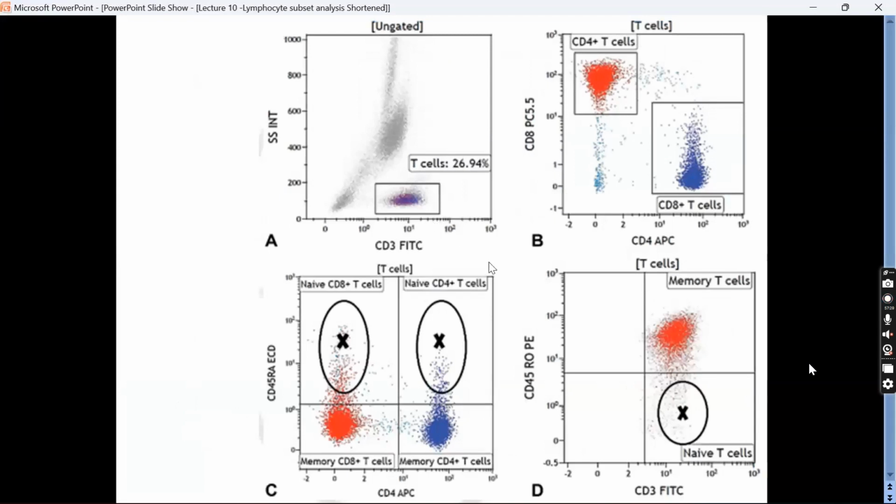Okay, again, this is a case of atypical SCID. You find here normal T cells, and there is a labeling error. This is cytotoxic T cells and this is helper cells. You find the RA cells are very low in number. Predominantly they are RA negative, which are all memory cells. So this is abnormal leaky SCID.